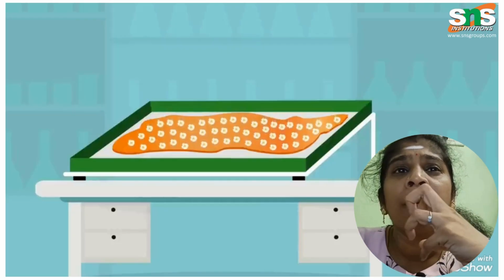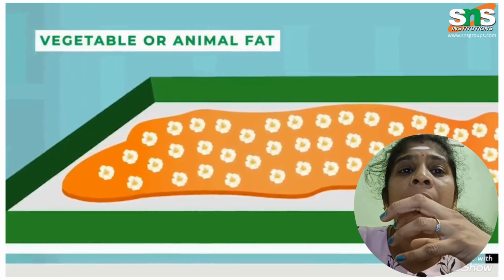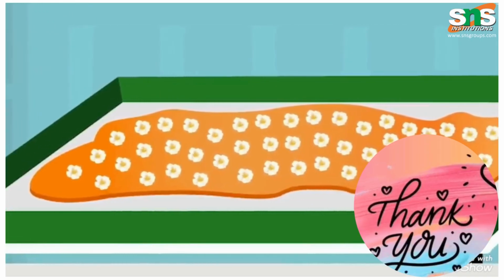So we have many types of extraction methods, that is, distillation and so on.